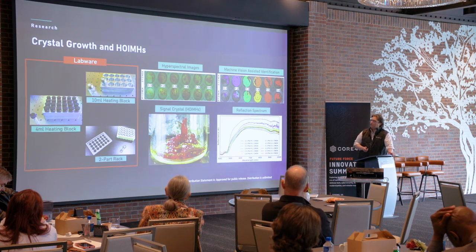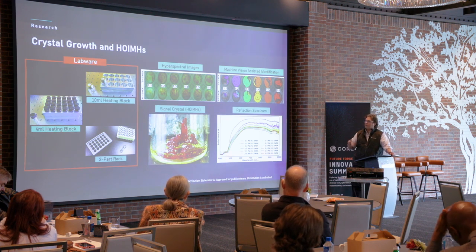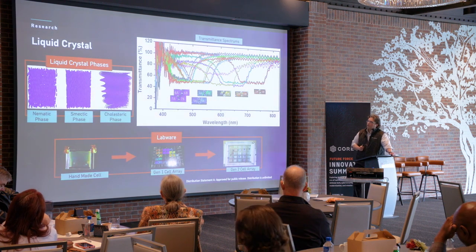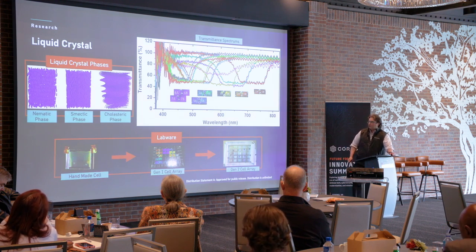For this one, heat is very important, and distributing the uniformity of the heat is important. Here we used the machine shop on Wright-Patterson base to create our own heating blocks that were based on the original Valrac's design.